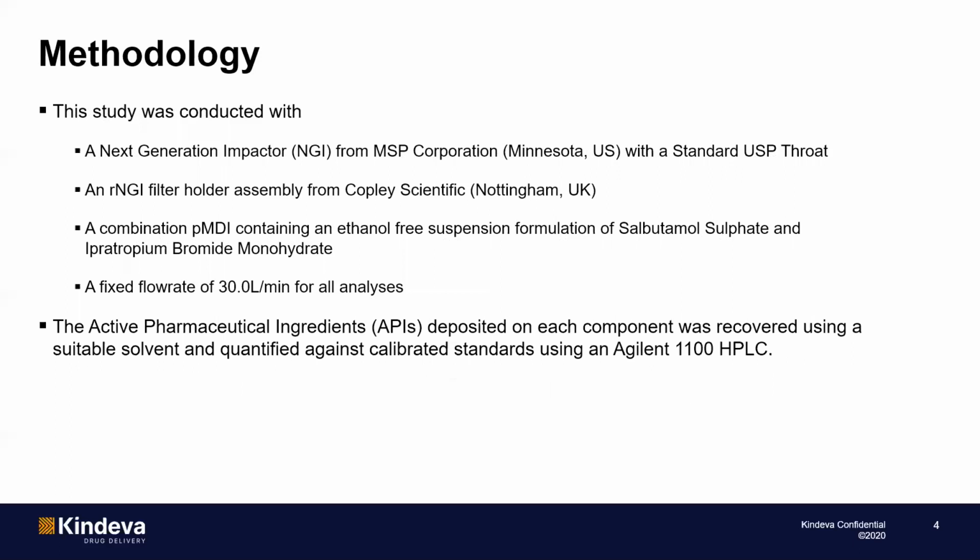The active pharmaceutical ingredients deposited on each component were recovered using a suitable solvent and quantified against calibrated standards using an Agilent 1100 HPLC. This methodology was validated for specificity, method precision, accuracy, and standard stability.